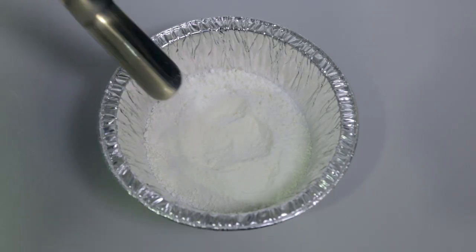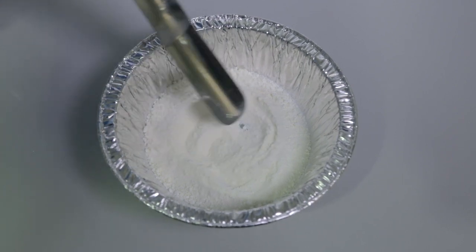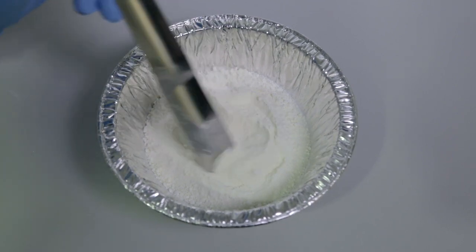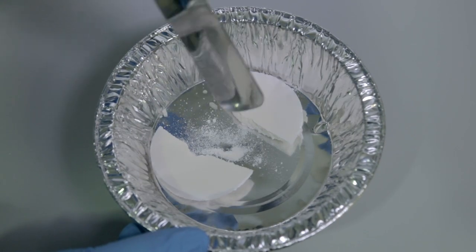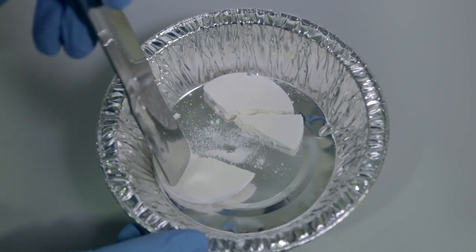Caking is a mechanism which affects a number of powders, particularly those in the food industry or those that are generally hydrophilic. It's a mechanism whereby particles that were formerly independent become bonded chemically or mechanically to one another, forming a large structure made up of formerly independent particles. Here we can see milk powder that's been subjected to elevated humidity conditions for a period of 48 hours. When it was introduced to this environment it was initially a free-flowing powder, but as you can see the process of elevated humidity has caused the particles to bond with one another, moisture migrating from one particle to the next, dragging molecular structure with it and causing a mechanical bond.